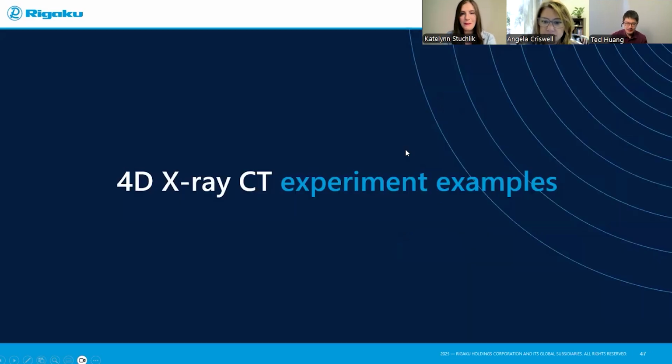All right, thank you. Okay, so in the last chapter, I'm going to show you some 4D X-ray CT experiment examples that I did here in our office with the Rigaku hardware and capability.